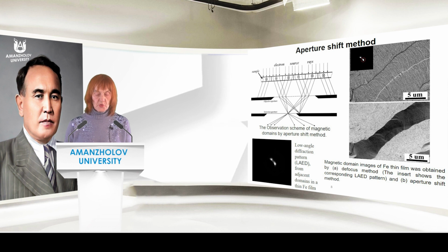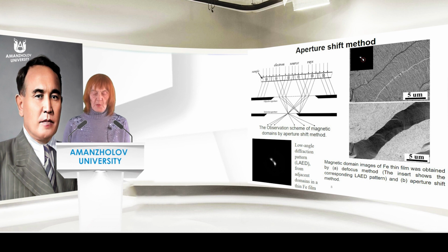The selective aperture is used to isolate the split low-angle electron diffraction peaks. This is analogous to the operation of the objective lens aperture in transmission electron microscopy mode.